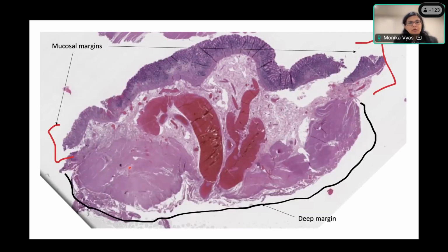So one thing about these specimens is you have your mucosal margins, which are the lateral edges of the mucosa, and then you have the deep margin where the specimen has been resected from the deeper bowel structures. Presence of cautery is something that is very helpful in these specimens, and because these specimens are small, the ink tends to flow and may not be that reliable. Presence of cauterized changes is something you can look out for and report on.